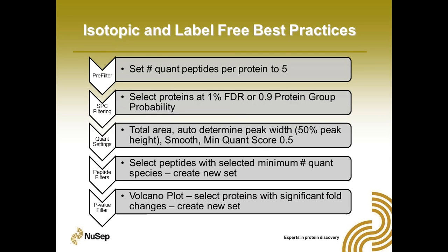Now, in the older versions of ProteoIQ, you would have probably manually gone through some of the proteins, looked at things that were up or down regulated, and made a judgment call. We've worked to simplify that for you. Because we have the theoretical distribution alignment, it's robust, and because we have an onboard p-value via an ANOVA, you can move directly onto protein quantification. Originally, this was a two-step process, or it could be a multiple-step process if you have a lot of groups.